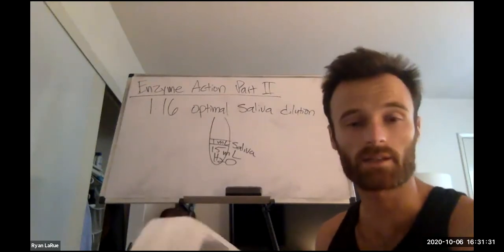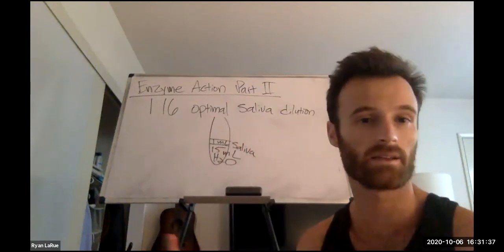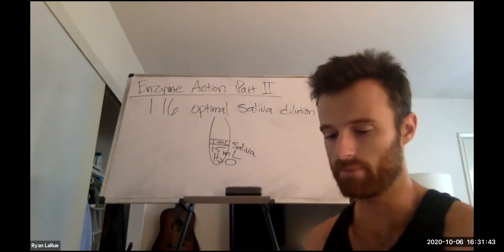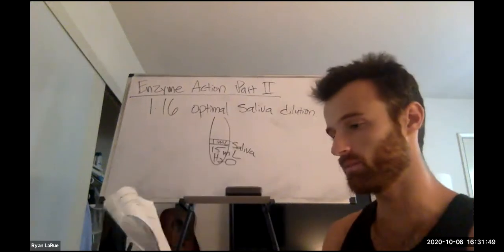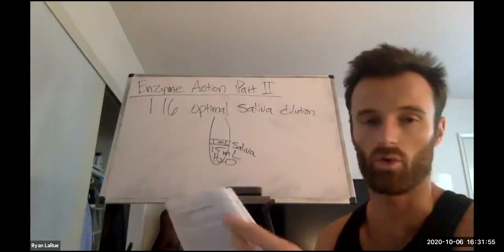So what I'm going to do in this lab mini lecture is I'm going to go through each of the 3, how to run the experiment for each of the 3 and test each of the 3. And then you can choose one based on which one you're curious about. And so if you chose NaCl as your environmental factor, you would complete this page, but you wouldn't complete the page for temperature or pH.